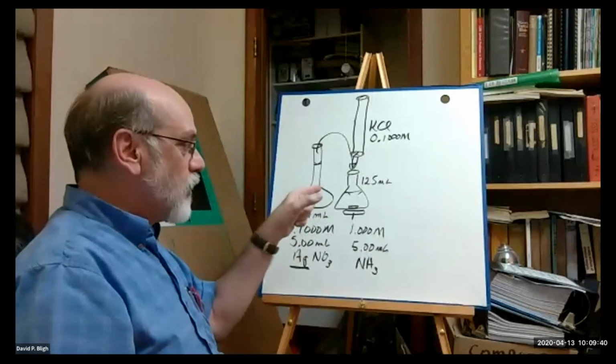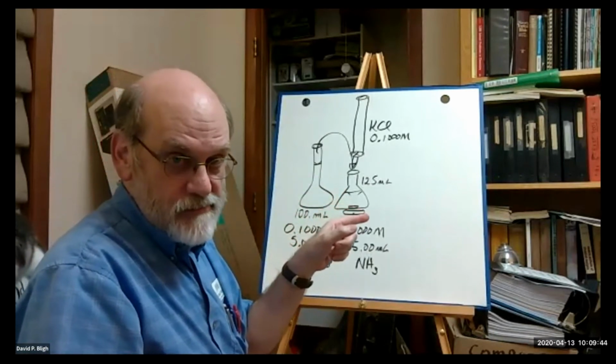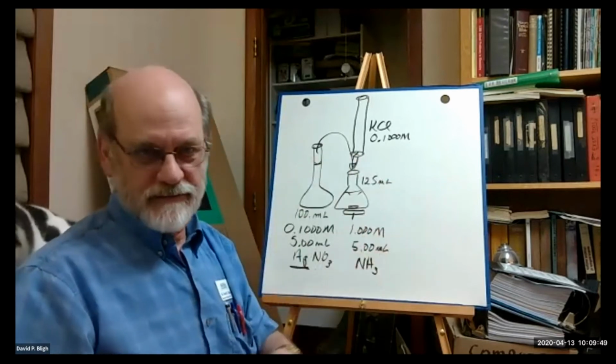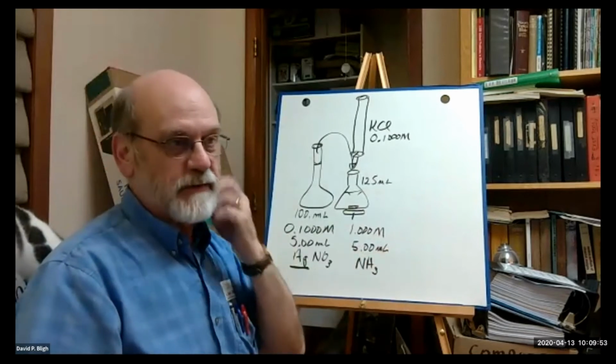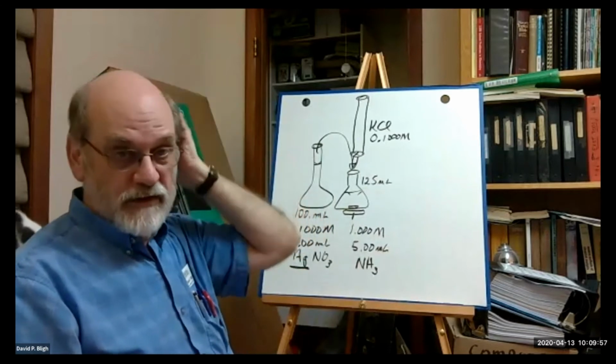And how do we know when silver chloride develops? Well, we use an ancient effect by our standards, early 19th century, by a scientist by the name of Tyndall. It's called the Tyndall Effect.